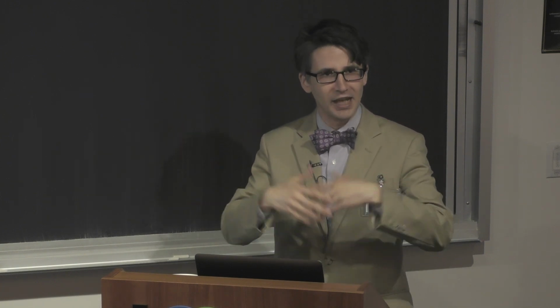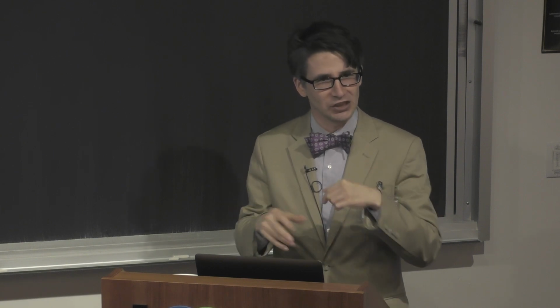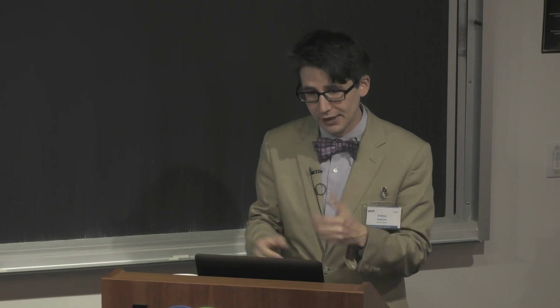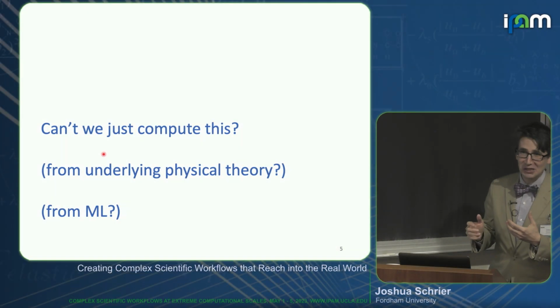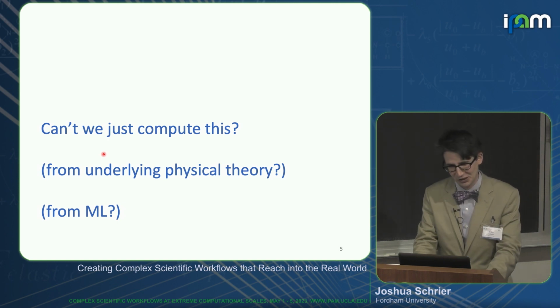These are held together by a vast array of non-covalent interactions, all of which are very subtle and very easy to get wrong. And we're interested in the kinetic processes that allow us to grow large, high-quality single crystals. So, all right, we can't use physical theory. Why don't we just bring out the hammer of machine learning and try to solve it that way?